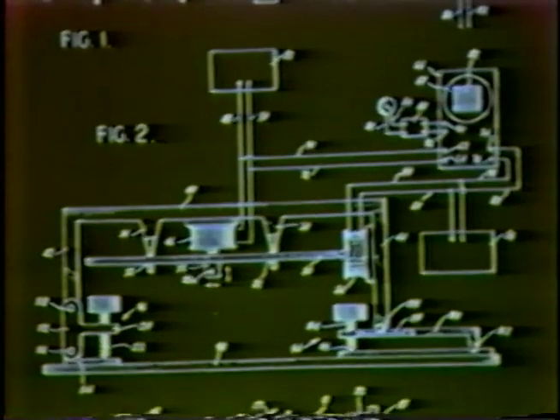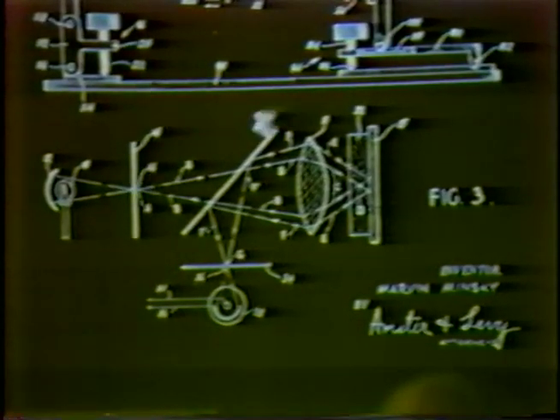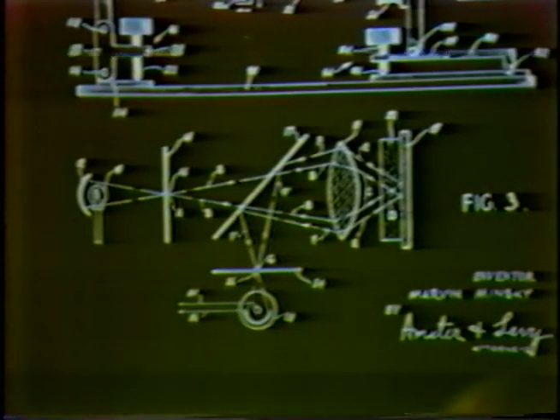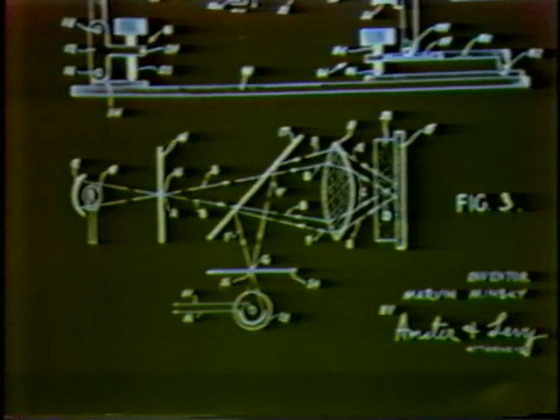He also indicates here a reflected light configuration of the same thing. Here's the illumination pinhole, a beam splitter, and the returning light put onto a pinhole in front of the detector system. Well, now, Minsky got that going. He demonstrated it to many people, but he never published it in the proper scientific literature, and he never even bothered to record a picture that was taken with his microscope.